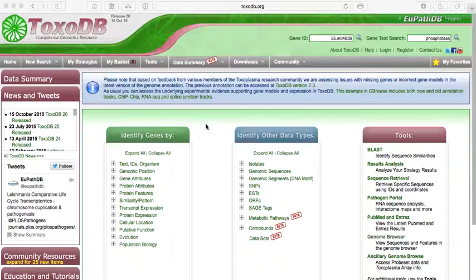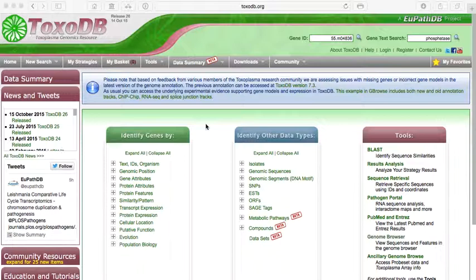It includes the genomes of all of these organisms and a lot of different types of data that's associated with the genomes. For example, all these genomes have genes. They have thousands of genes.